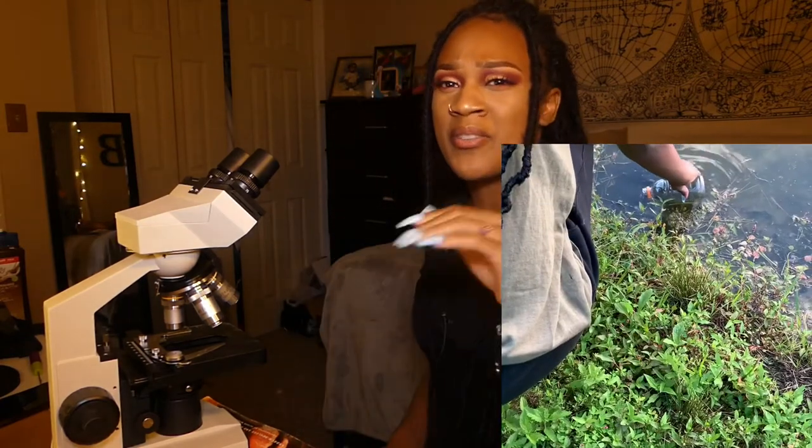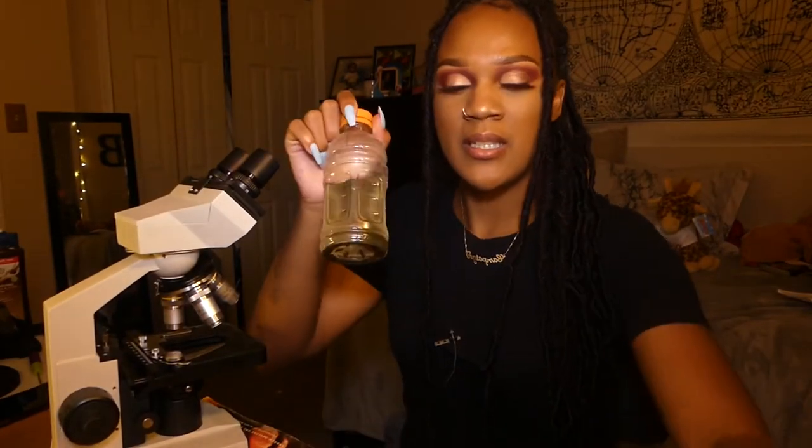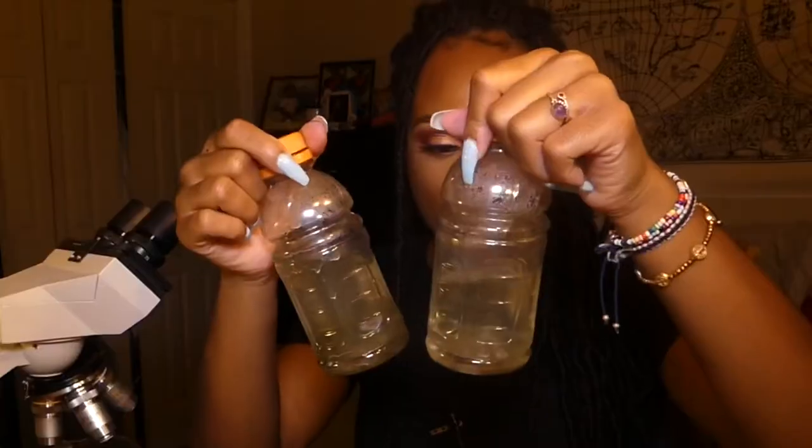So today we're gonna look at what we can find in pond water. I went to my neighborhood, like little forest, and there were a few ponds there, and I just took a sample. There was a creek deeper in the forest where I took a sample, but we got some fun samples, so I'm excited to see what we can see in them. So I'm going to prepare my slides. First things first, I'm going to test the still water pond, which is in these Gatorade bottles.